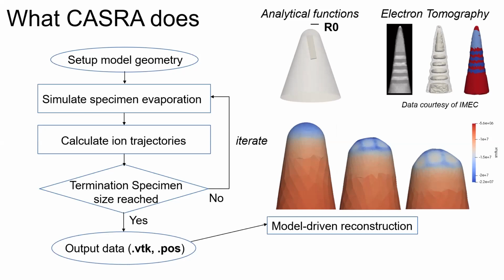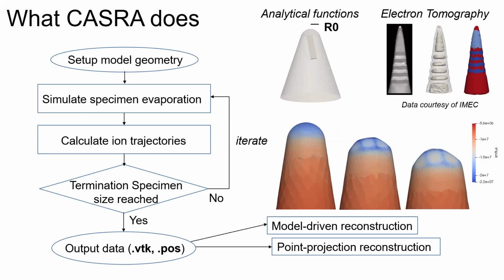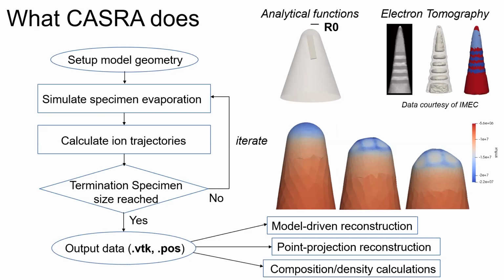And then a number of additional tools are also provided in the package, one of which is to perform this model-driven reconstruction. The other is to just perform standard point projection reconstructions on simulated data. And then finally, there's some tools to calculate composition and density throughout your reconstruction.